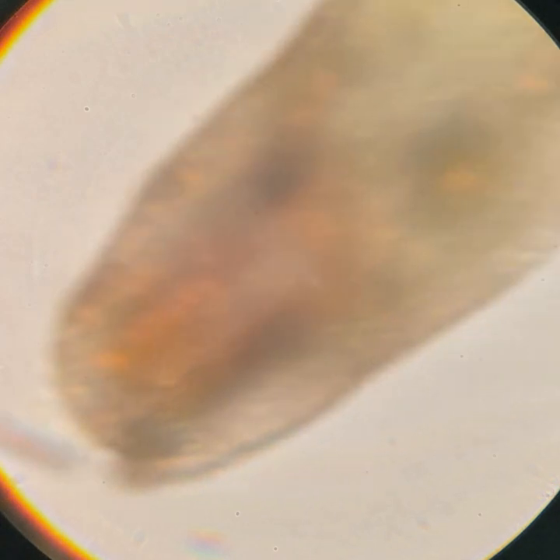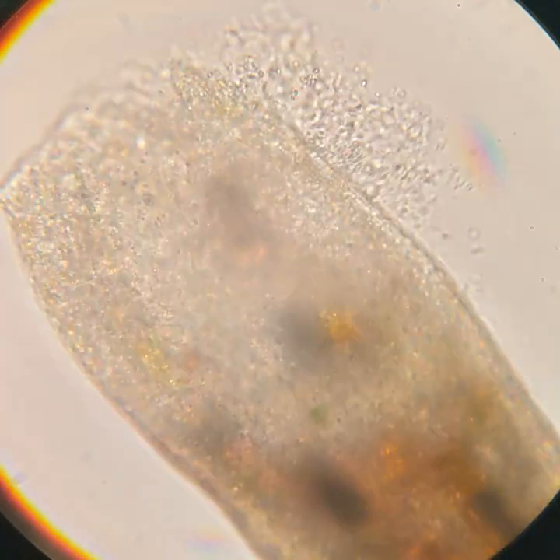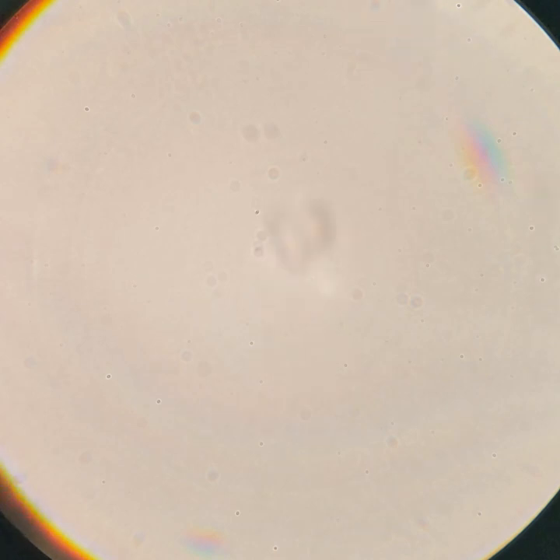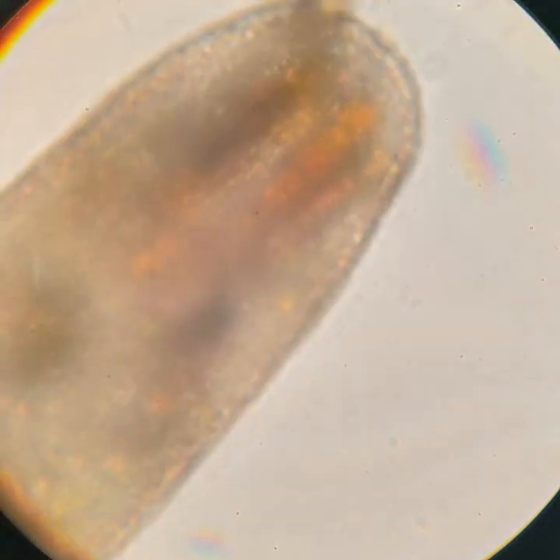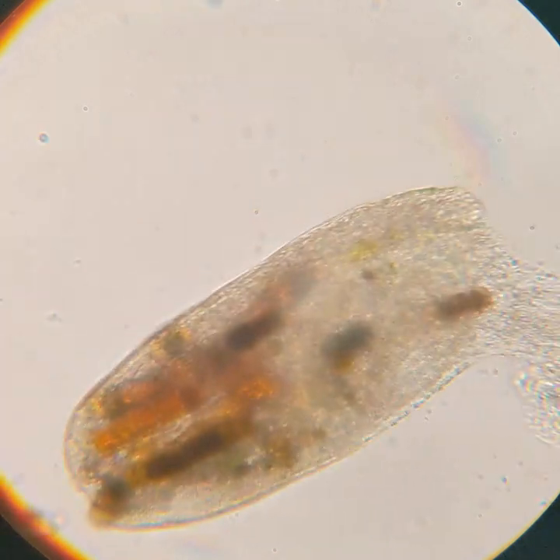By the way, as I adjust the focus here, doesn't it look like he has an eye and a mouth, like some sort of whale or something? Anyway, as I continued to follow this little guy around, I pretty quickly noticed that he's not going to be okay. So I decided to go to a lower magnification so that we could see more detail, and at least stay with him for the last few moments of his life.